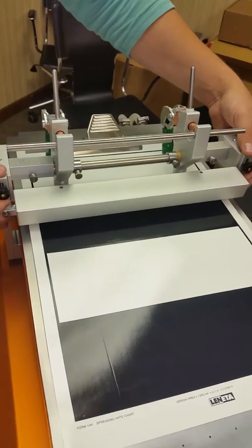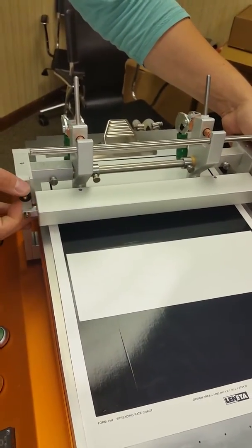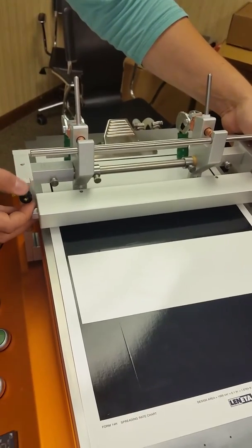On the side, you have two adjustment screws so you can lift the bar up and down as you choose.